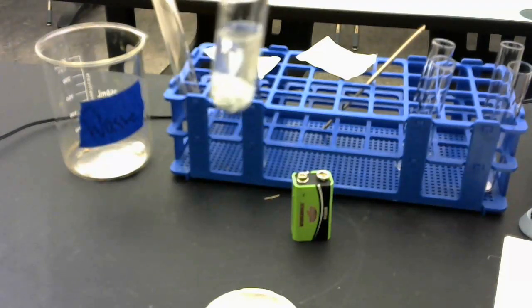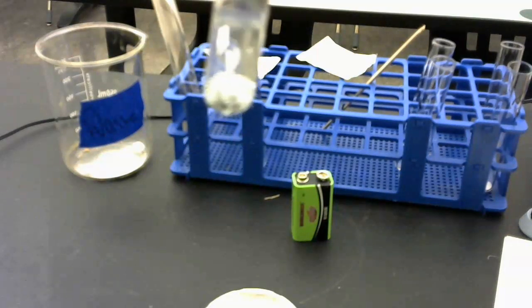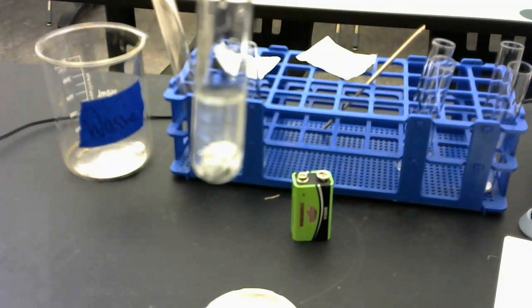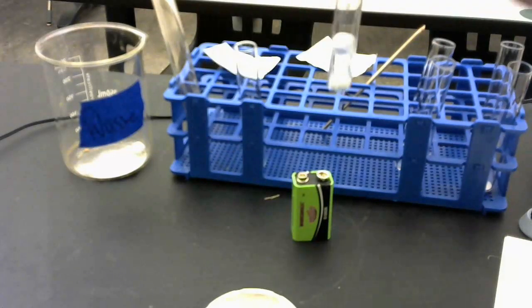And something to remember, zinc always has a +2 charge. So when you're writing your balanced chemical equation, recognize that zinc always has a +2 charge. But you can really see those bubbles starting to form. So I'm going to let that sit and react a little bit.